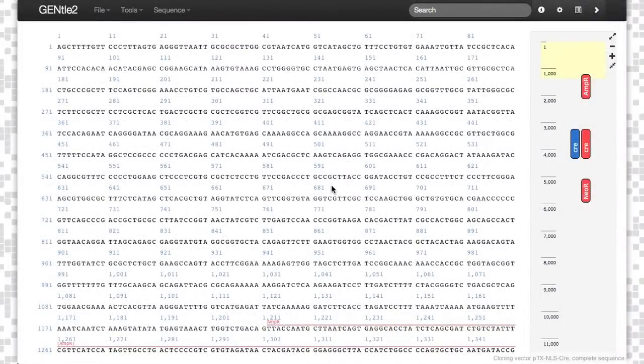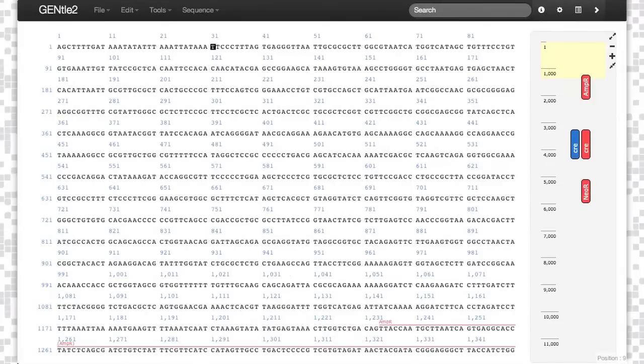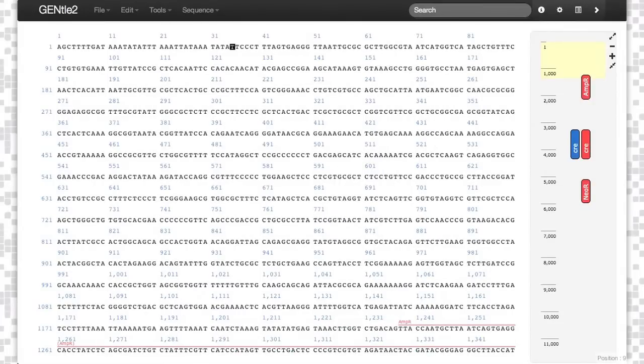Loaded DNA can be edited by double-clicking on a base. When the nucleotide has a black square around it, you have entered editing mode. You can then begin editing the code. Double-click off the canvas to exit editing mode.